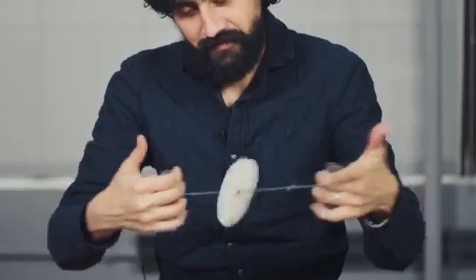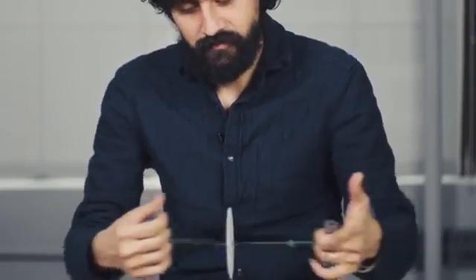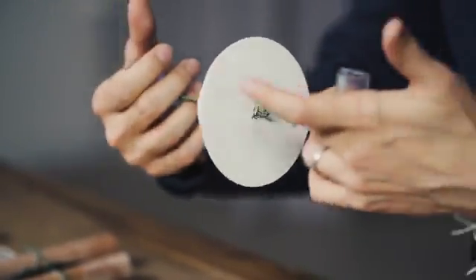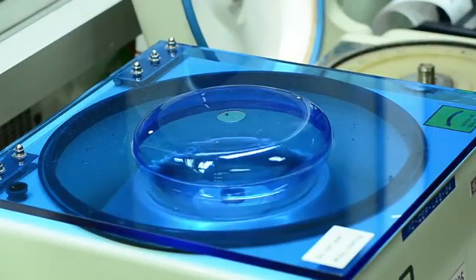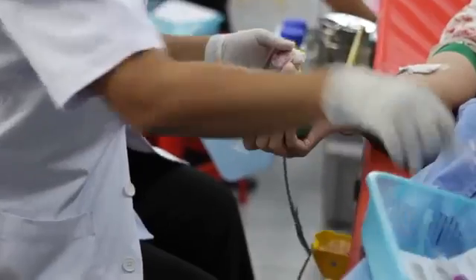You hear that? That is the sound of a groundbreaking scientific device. It's called a paperfuge — a centrifuge made of paper. Like a traditional centrifuge, it works by separating the contents of biological samples by spinning really, really fast. That's an important first step for diagnosing illnesses like malaria and HIV.